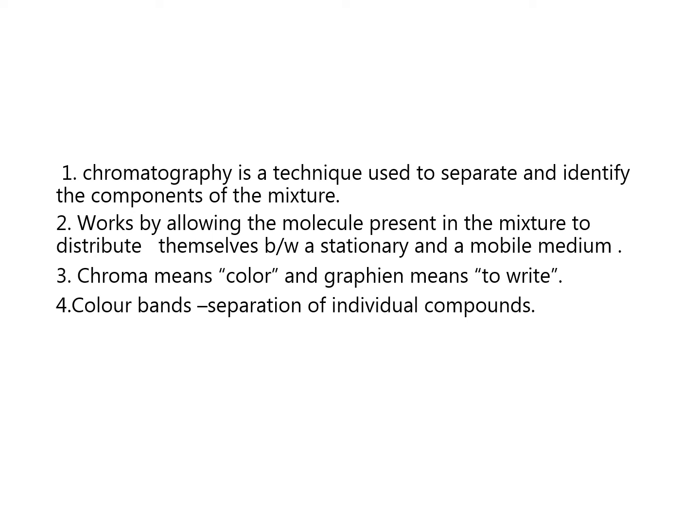If a layman asks what a chromatography technique is, the answer is that it is a routine laboratory technique used for the separation of components, and it has two main components: the mobile phase and the stationary phase. The principle of working of every chromatography is different, but in each chromatography the components of a mixture distribute themselves between the two phases. The first is the stationary phase and the second is the mobile phase.